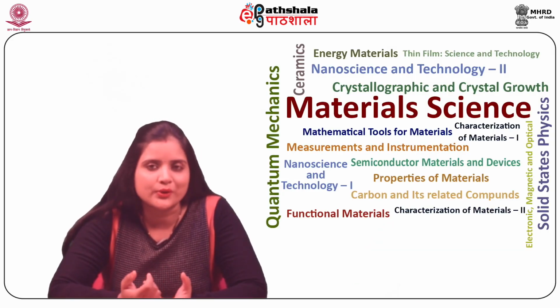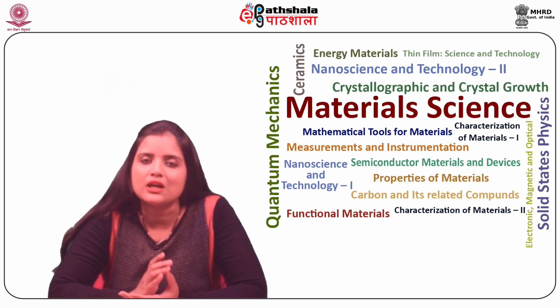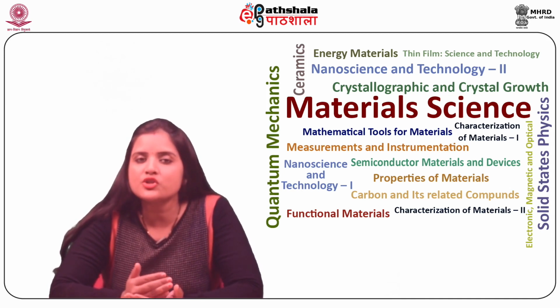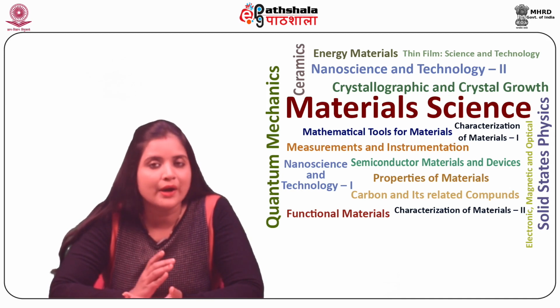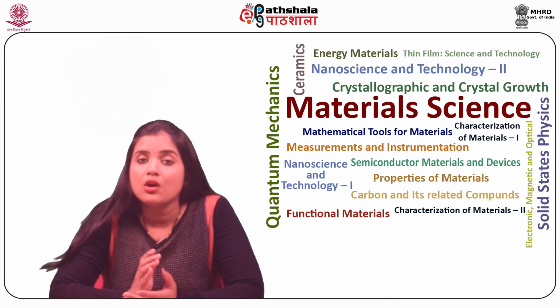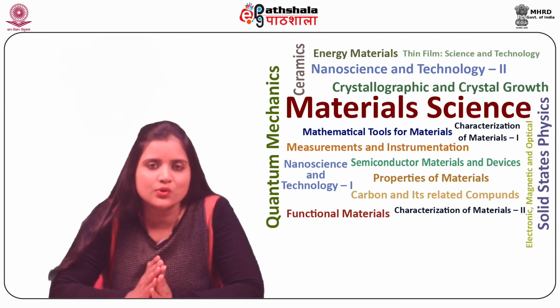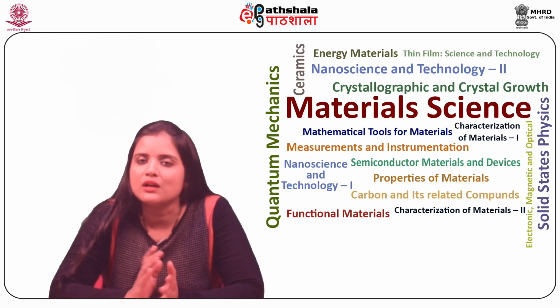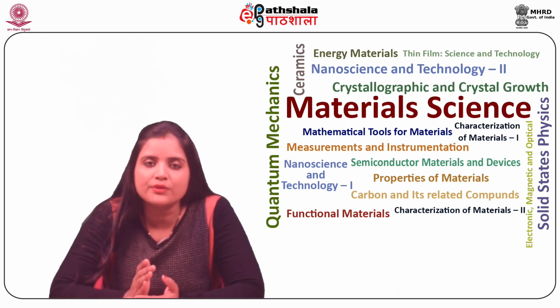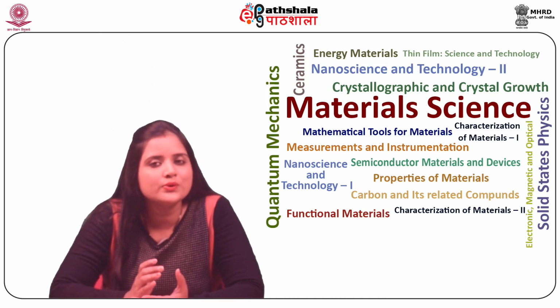The classical optical microscopy resolution limit was formulated by Abbe in 1873 and it has been an insurmountable hurdle restricting features detectable by optical microscopy to about one half the wavelength of light. Non-optical methods such as electron microscopy and tunneling microscopy have been invaluable in our understanding of the world on a smaller scale. But these suffer from their own limitations and can't benefit from the centuries of studies using light.